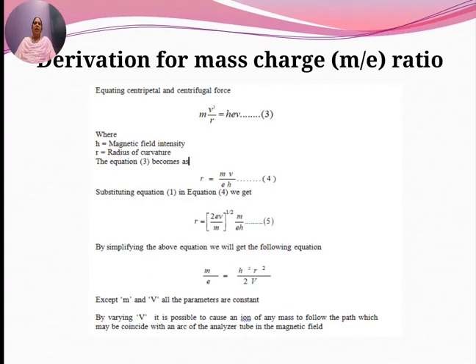So equating centripetal and centrifugal forces, now it is rotating. The ion is moving in a circular path. So you have what type of force? Centripetal force.